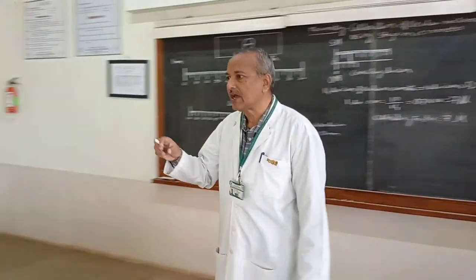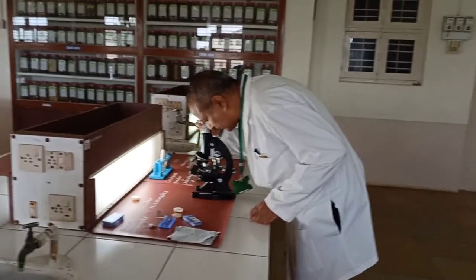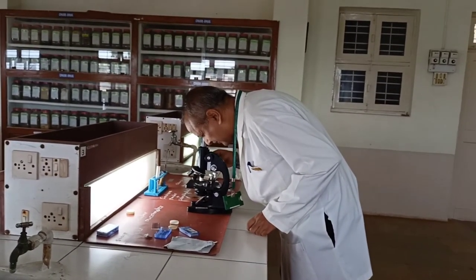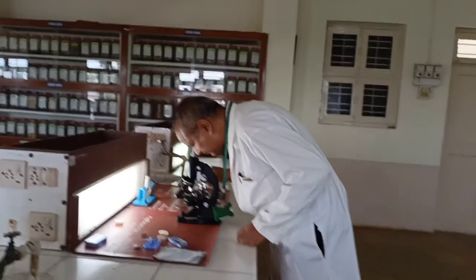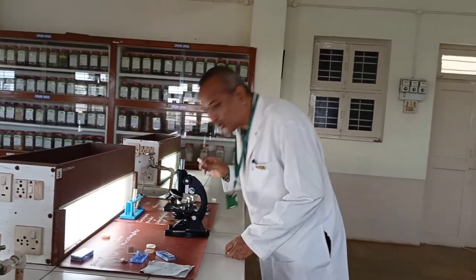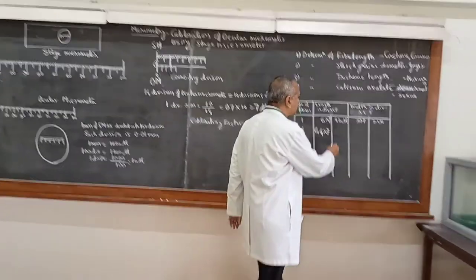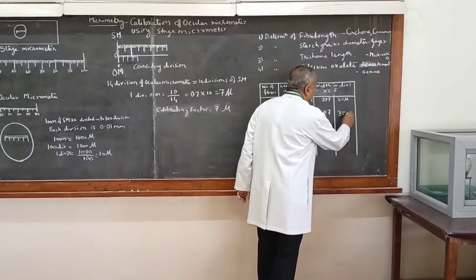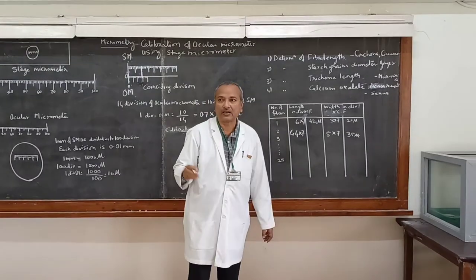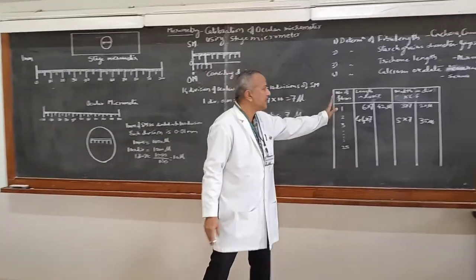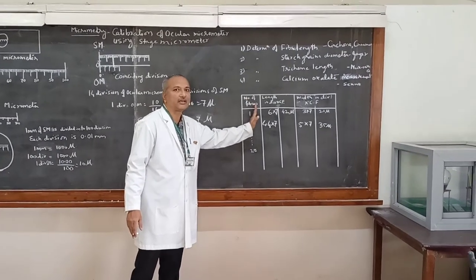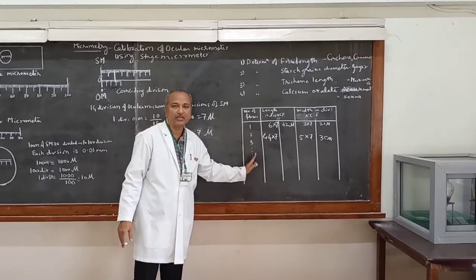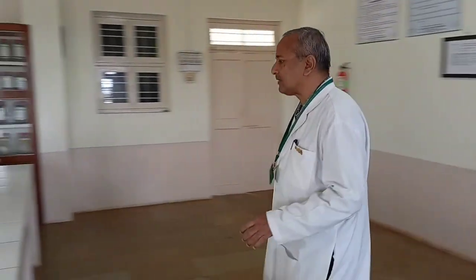Similarly, we rotate the ocular micrometer and measure the width of the fiber. The width is around 5 divisions of the ocular micrometer. Multiplying 5 divisions by the calibration factor gives approximately 35 microns. These values — length and width — are to be recorded for 25 fibers each. The highest fiber length, the average, and the lowest value are all to be noted; these three values are reported for fiber length determination.